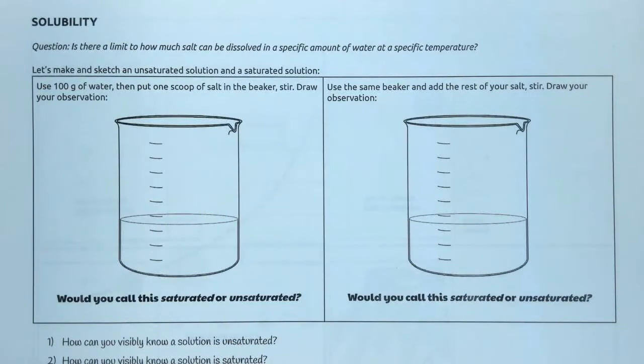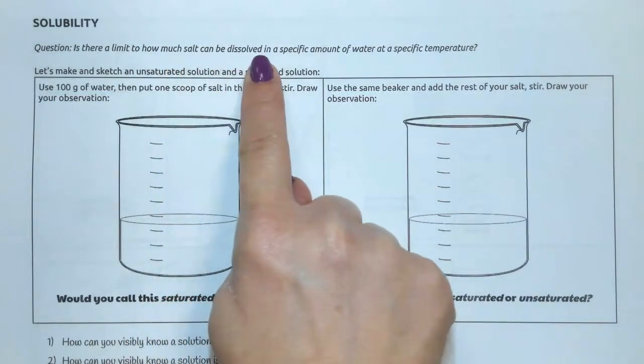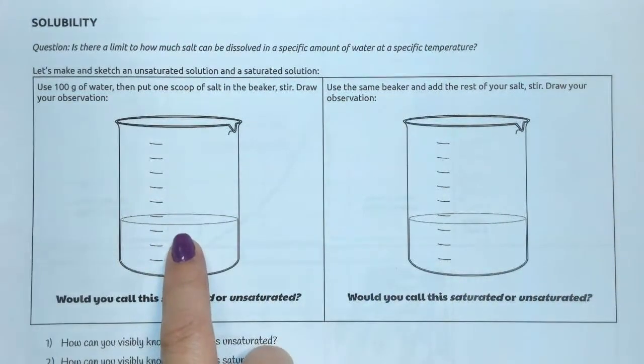Today we're going to do a solubility activity to introduce us to solubility. So first, let's pose the question: is there a limit to how much salt can be dissolved in a specific amount of water at a specific temperature? So we're going to do a little experiment.